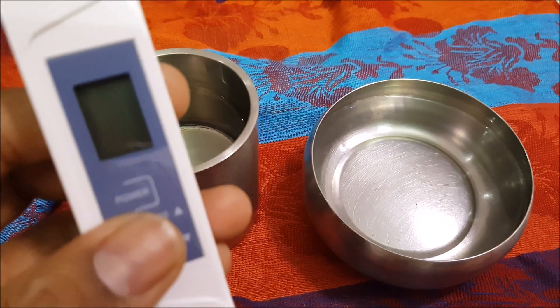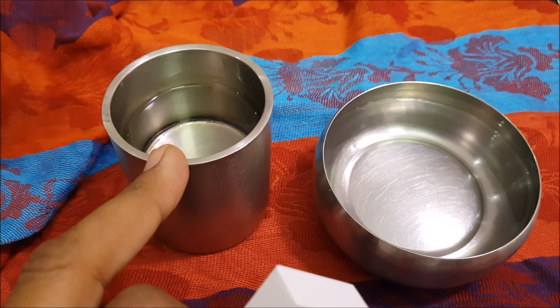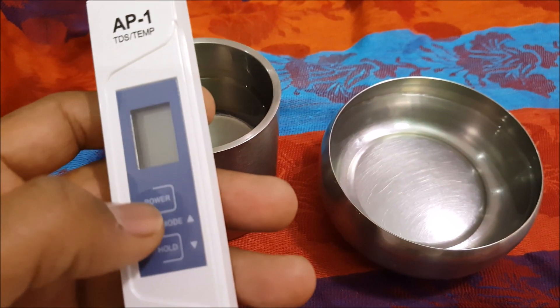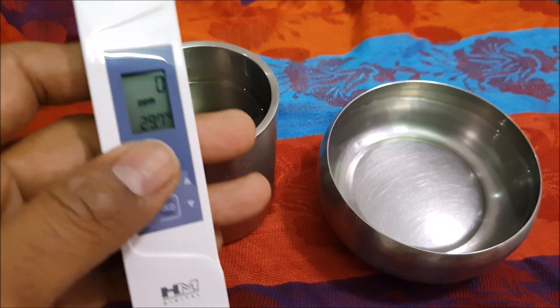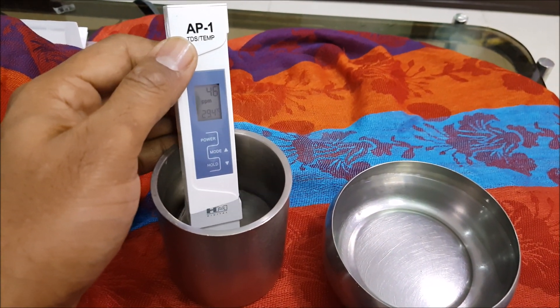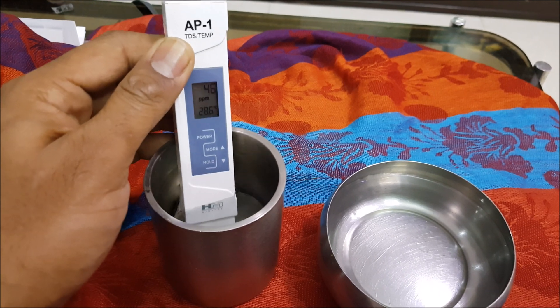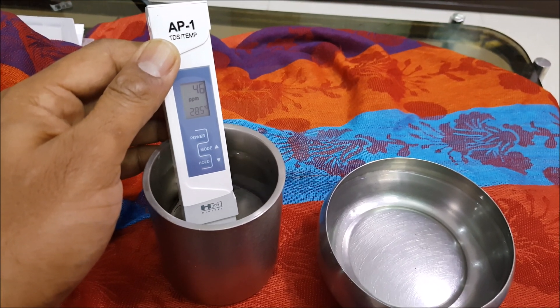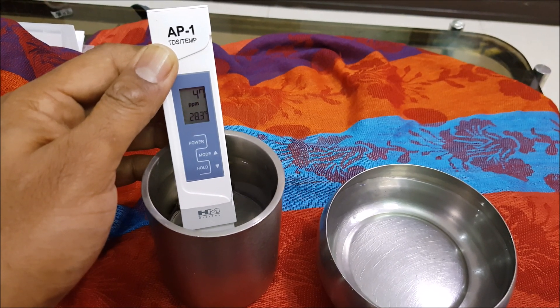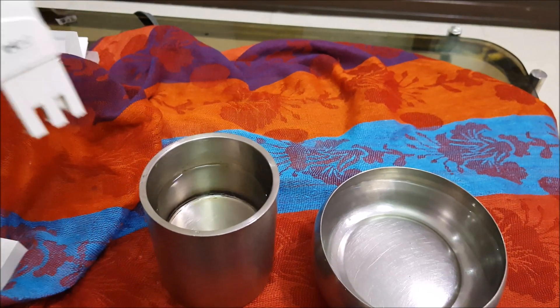Let's quickly test this TDS meter. I have two different water sources — one is tap water and the other came out of an RO. I click power — it shows zero — and I dip it in the tap water to about two inches. Give it a little jiggle to clear any air bubbles, and here it is: 47 PPM is the TDS for the tap water.